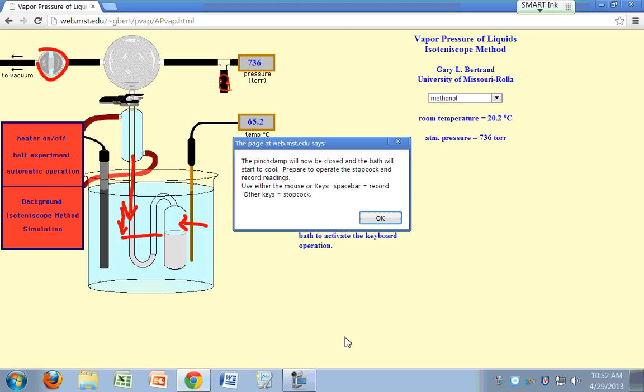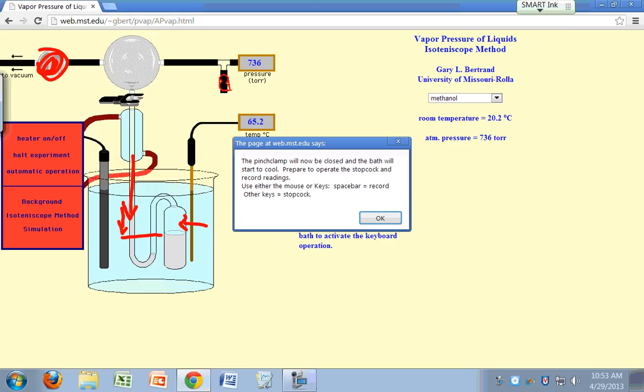So to record the pressure of the gas, what you need to do is hit the space bar. Now, as soon as you've measured the pressure of the gas, as soon as the two liquid levels on both sides of the U-tube are leveled off, what you need to do is turn the pump back on. And you turn the pump back on by just pressing any key, so you open up your stopcock here.